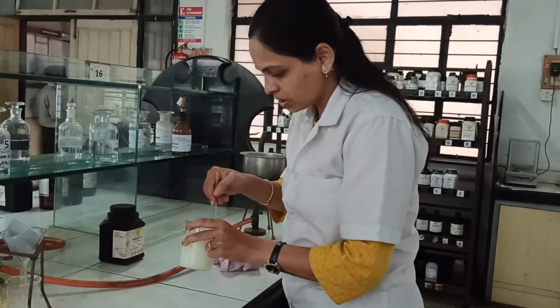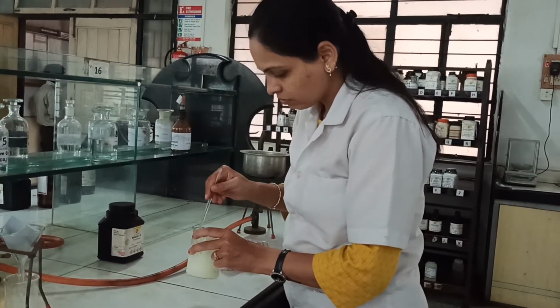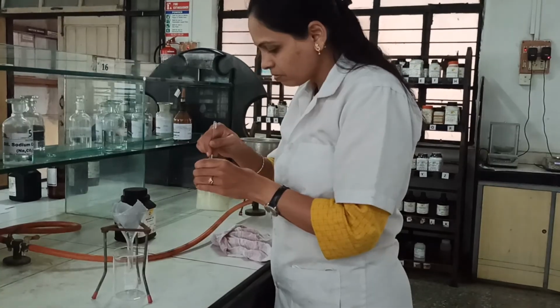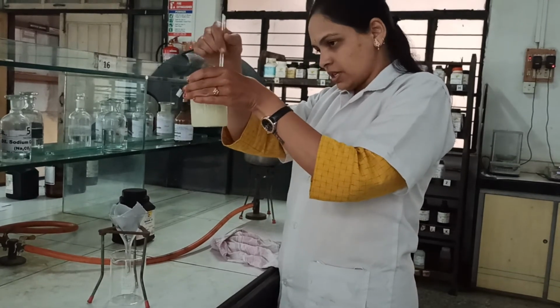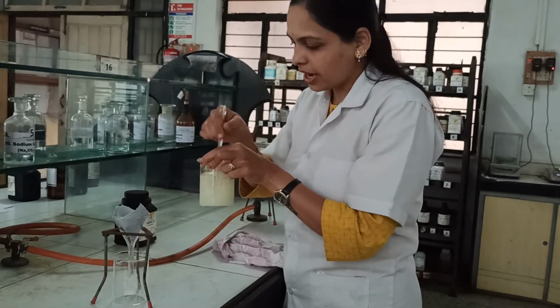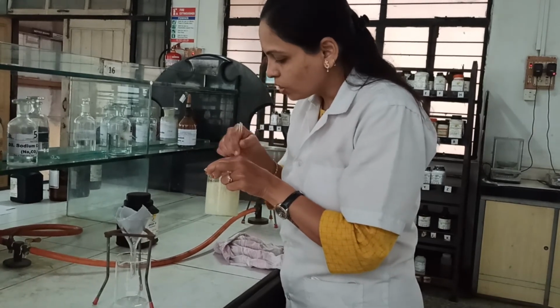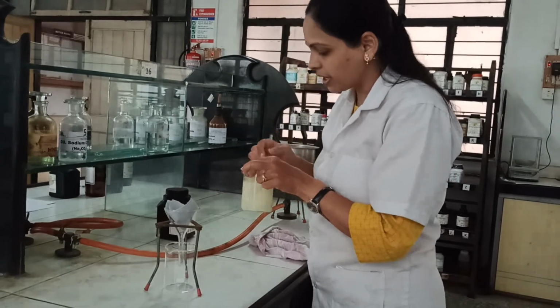We have to stir it continuously. Students, now you can see the precipitate in our reaction mixture after addition into ice cold water. Now we will proceed for the filtration.